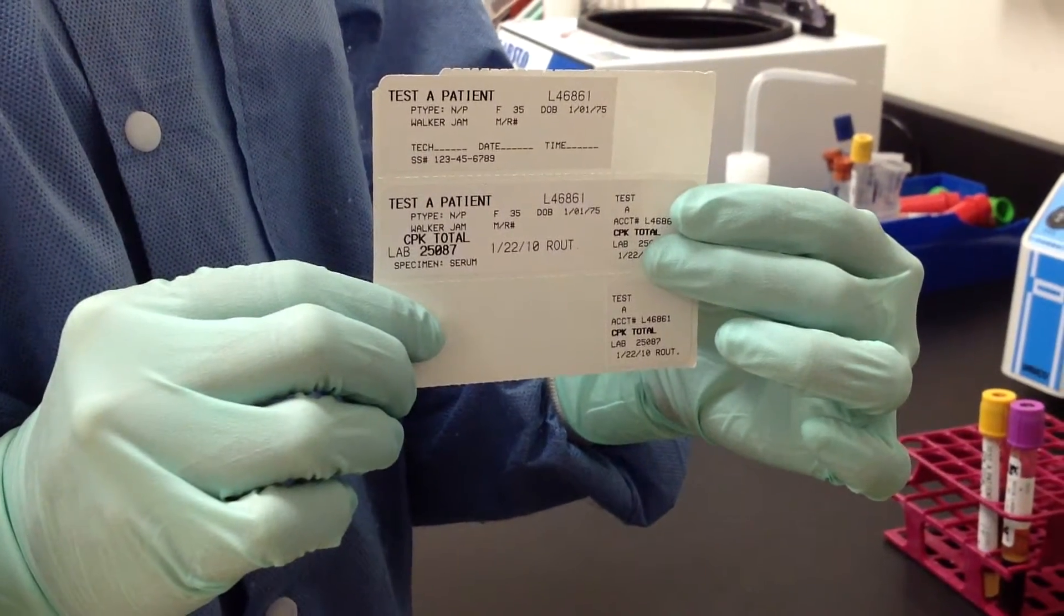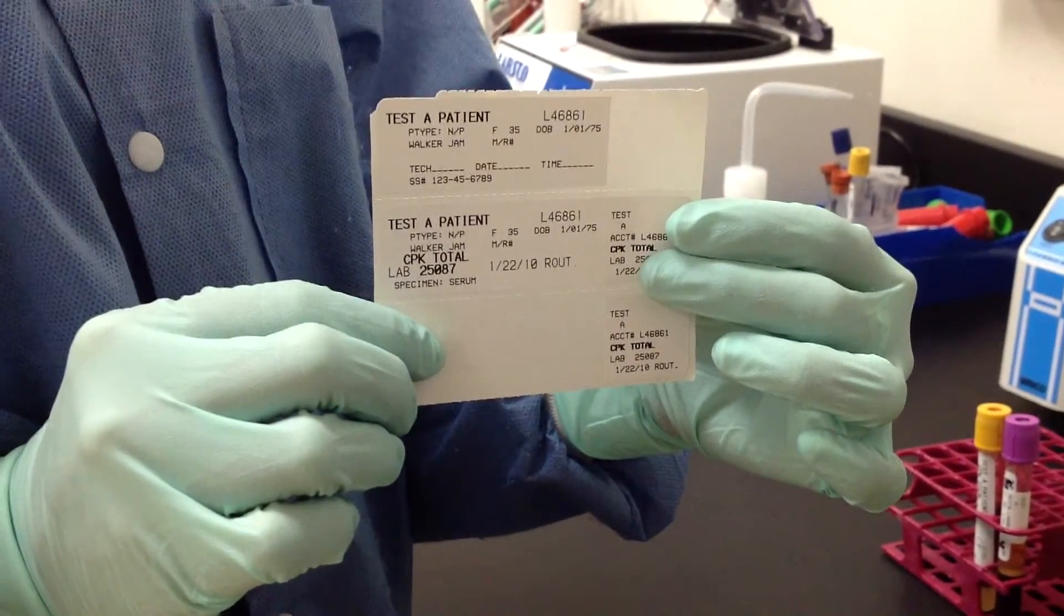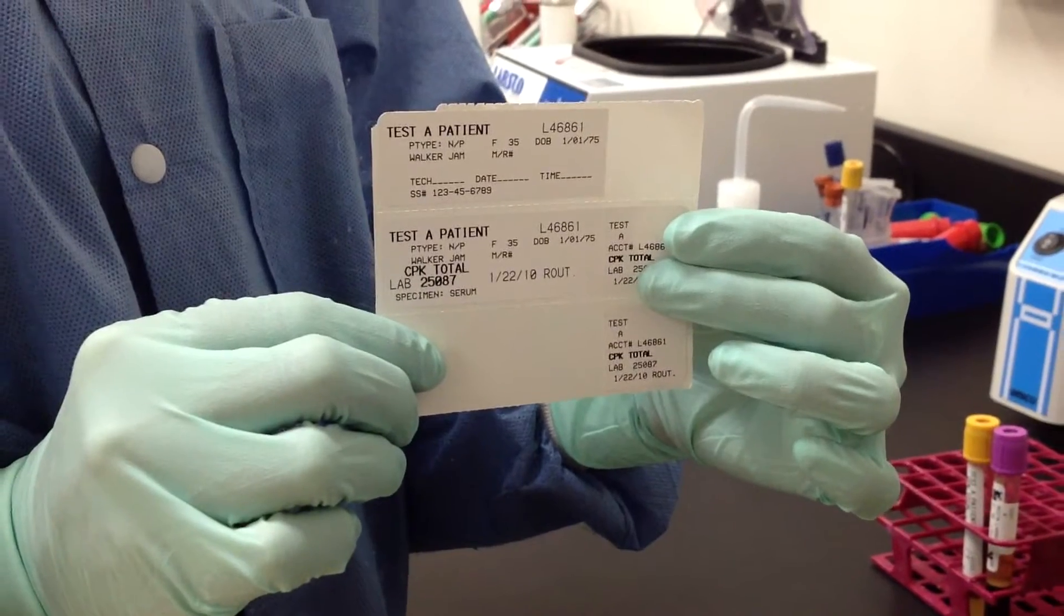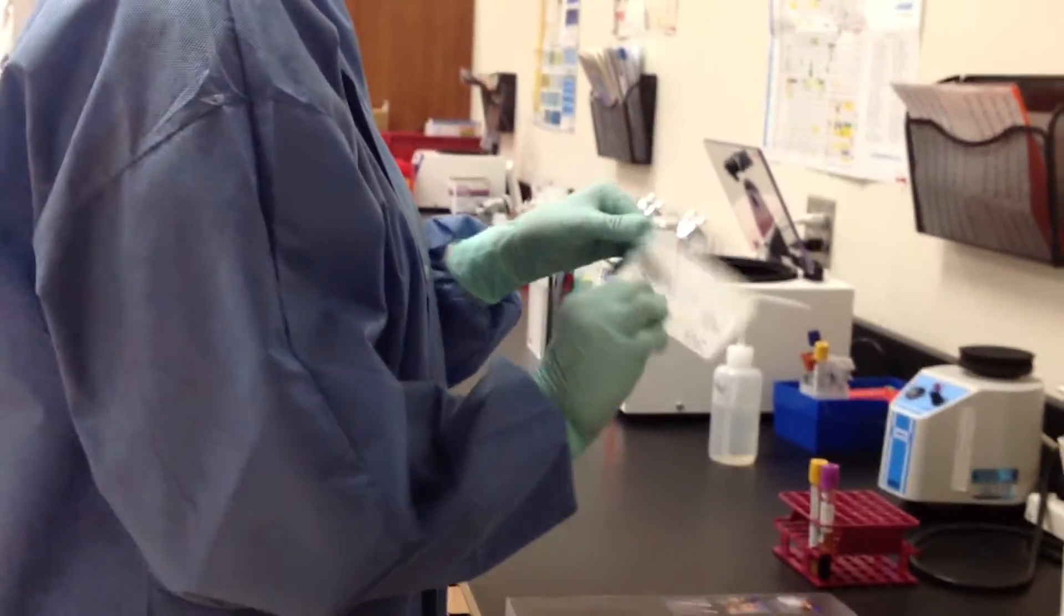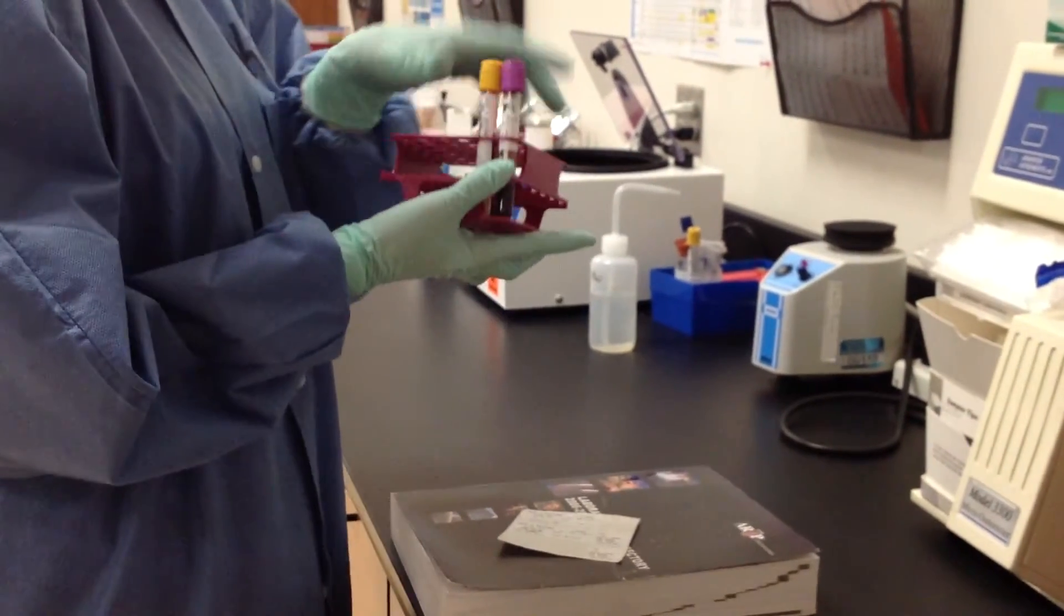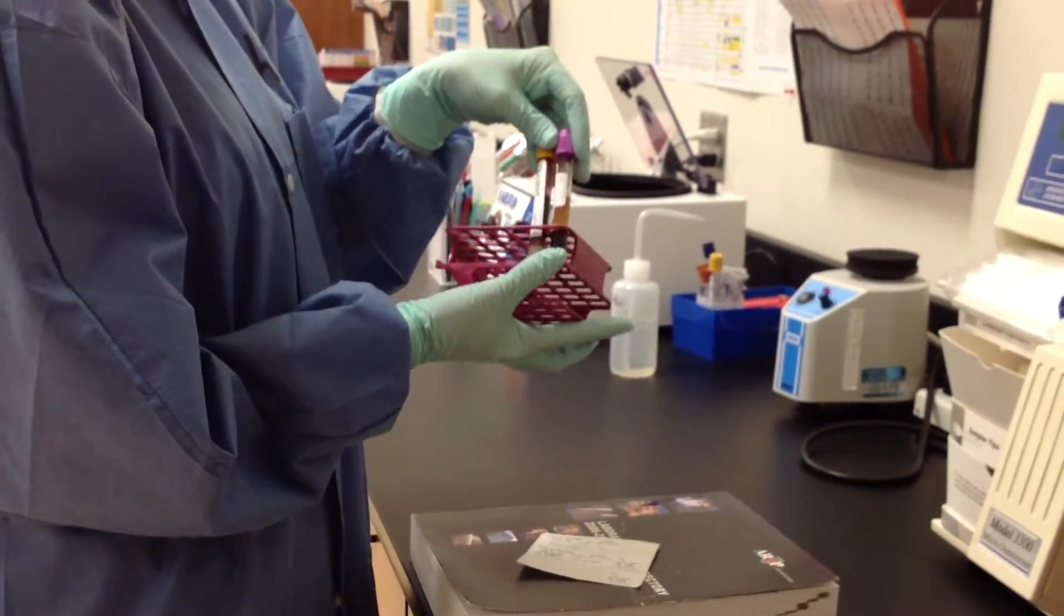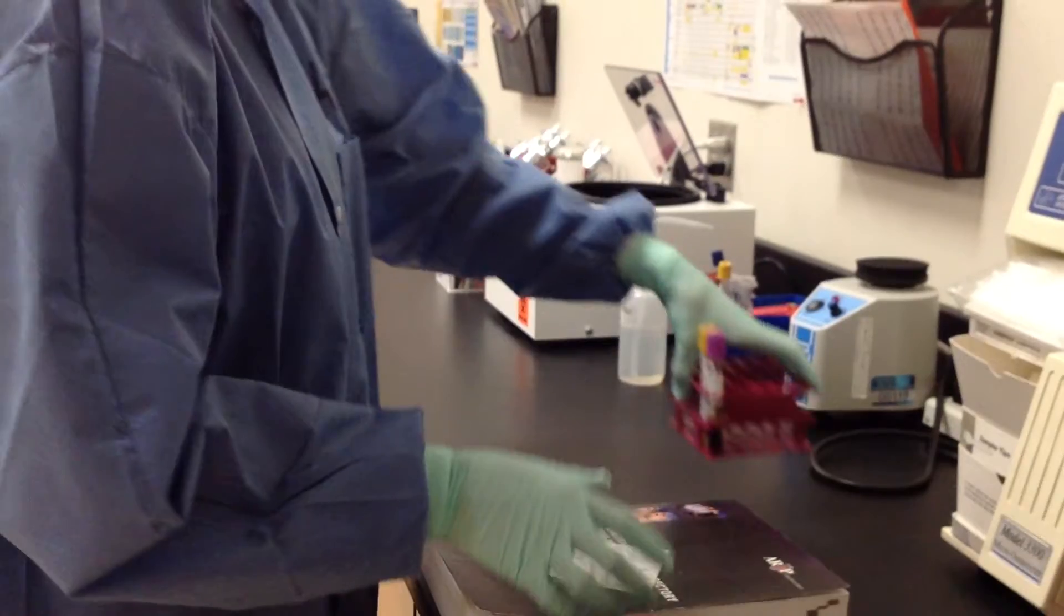This lesson is on specimen processing. Here we have a test order. We look at seeing what our order is, and we have two specimens to choose from, so we need to decide which one we need for this test.